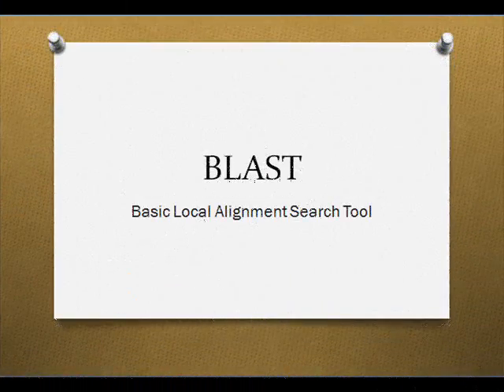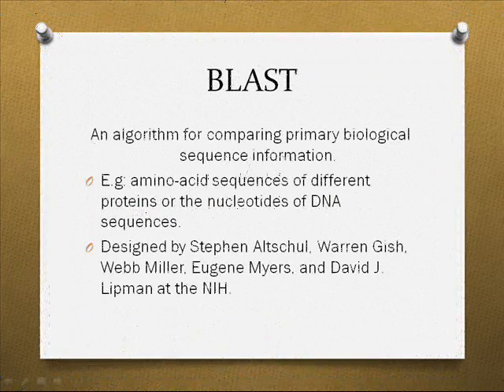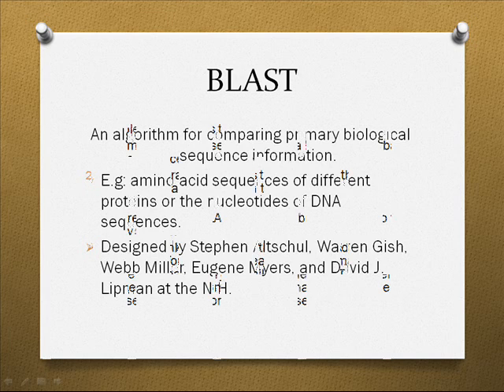For this video, we will be focusing on the usage of BLAST, or the Basic Local Alignment Search Tool. BLAST is an algorithm for comparing primary biological sequence information, such as the amino acid sequences of different proteins or the nucleotides of DNA sequences. The BLAST program was designed by Stephen Altschul, Warren Gish, Webb Miller, Eugene Myers, and David J. Lipman at the National Institutes of Health.